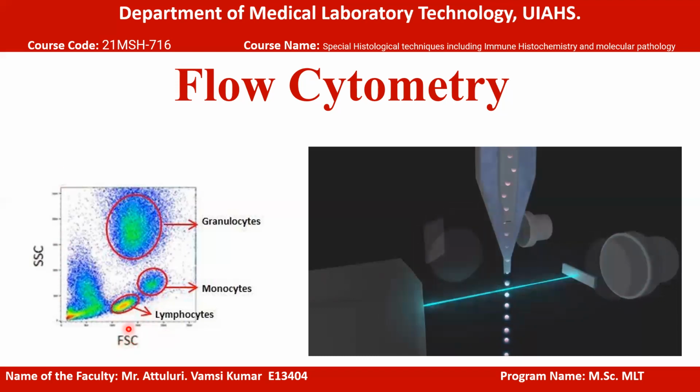See, these cells don't have any granules, so that is why they're at the bottom, but they're large. So large cell, no granules. Definitely there might be monocytes. So the bottom cells might be mostly monocytes. And here, these are granulocytes. They are large and they have granules. So granules and large cells might be granulocytes.